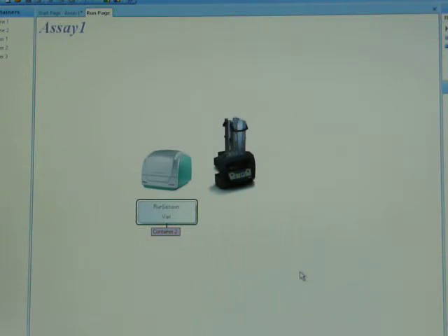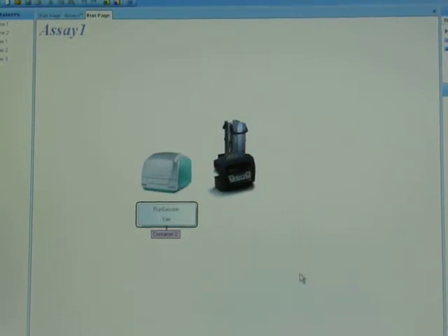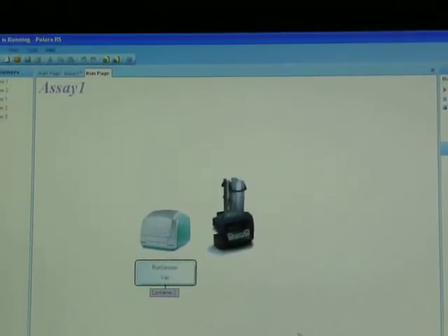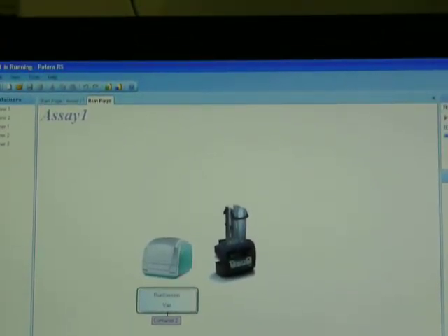What I'm going to do is pan up so you can take a quick peek at the RapidStack pulling those plates.